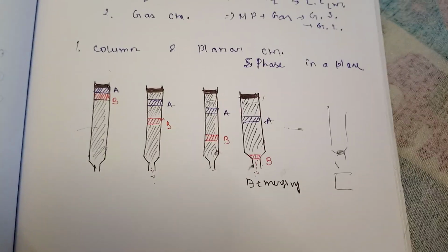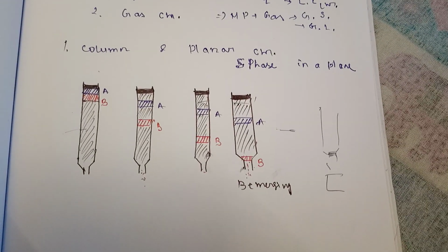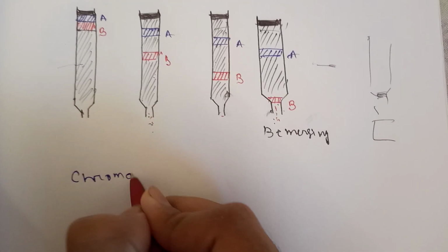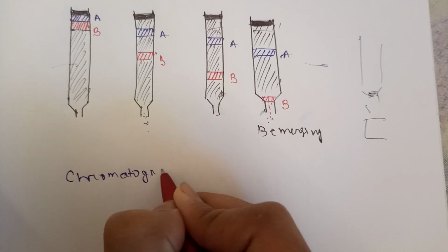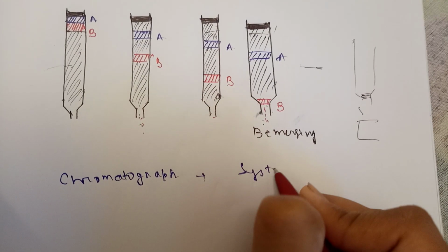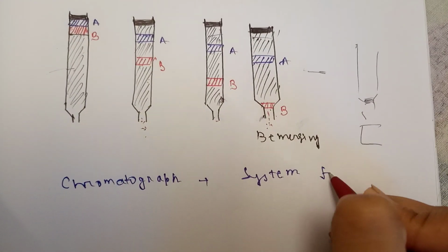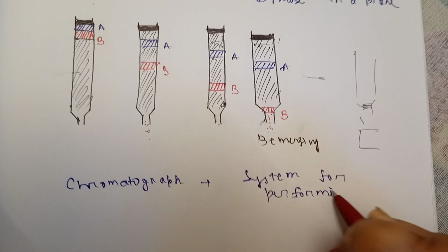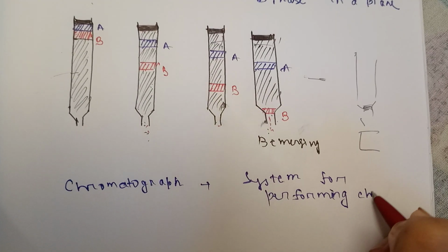Remember one thing, chromatography actually represents a technique. Okay, now what is a chromatograph? Now chromatograph is the system for performing chromatography.